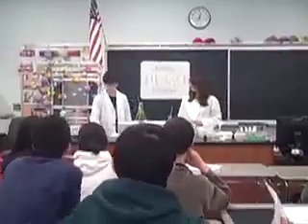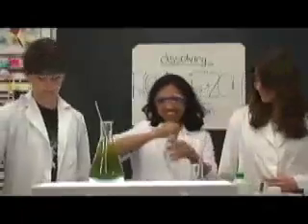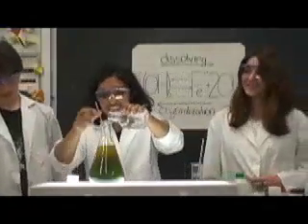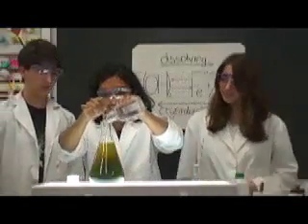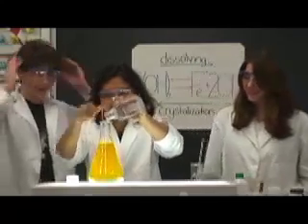Ew, look at that disgusting precipitate. Where's the NJCO? Wait, what did you just do?